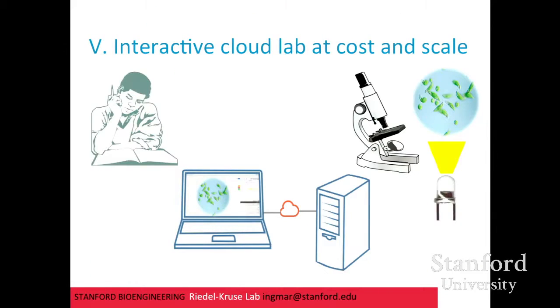Okay, and now let me come to the later half of my talk, more about this idea about cloud labs. So how can we now use these systems to allow people to interact over the web, right? And the general idea is a student or researcher sitting at home and running experiments over the web, right? Where you need to have an actuator and a sensor.